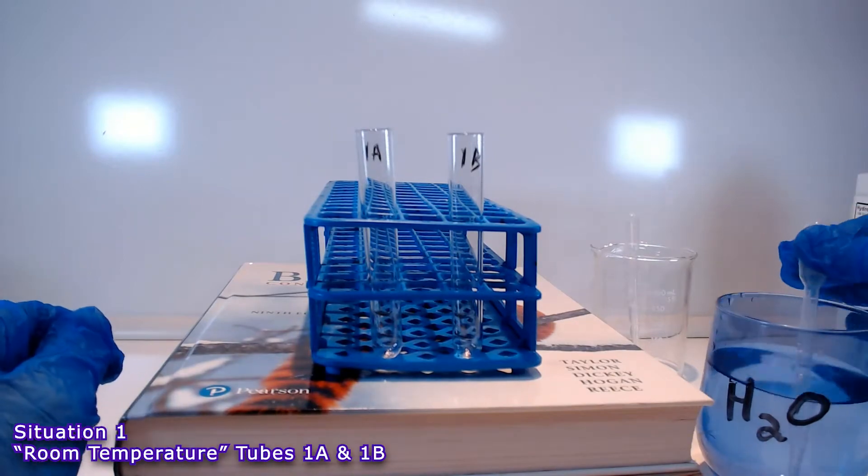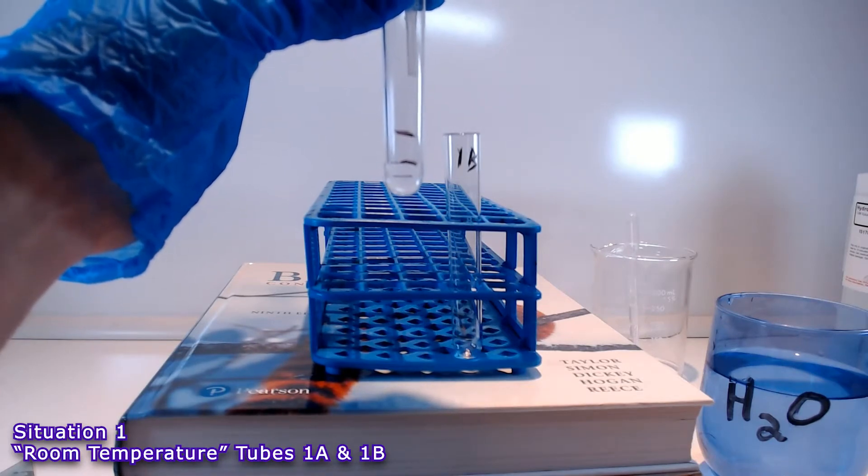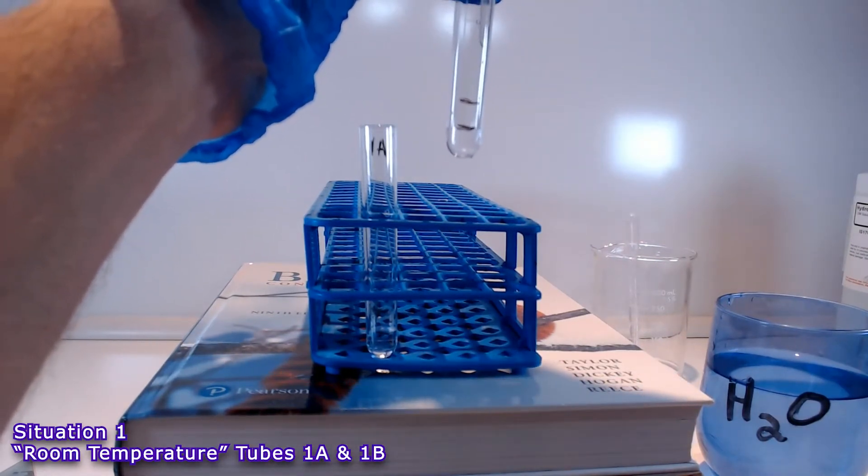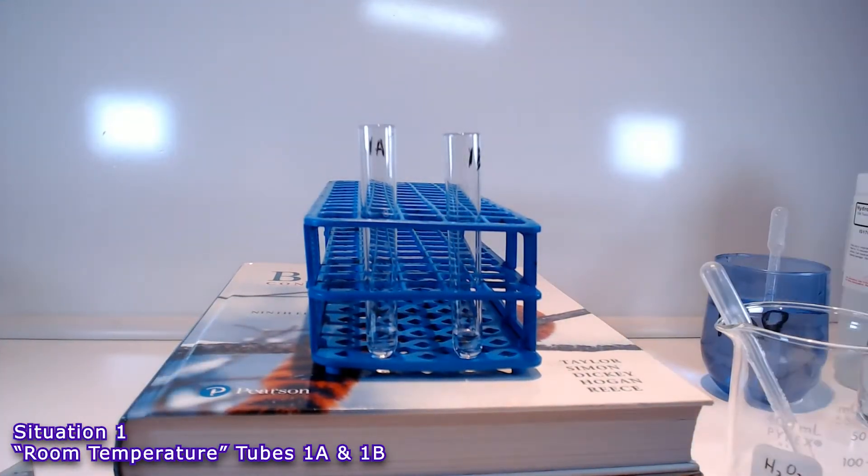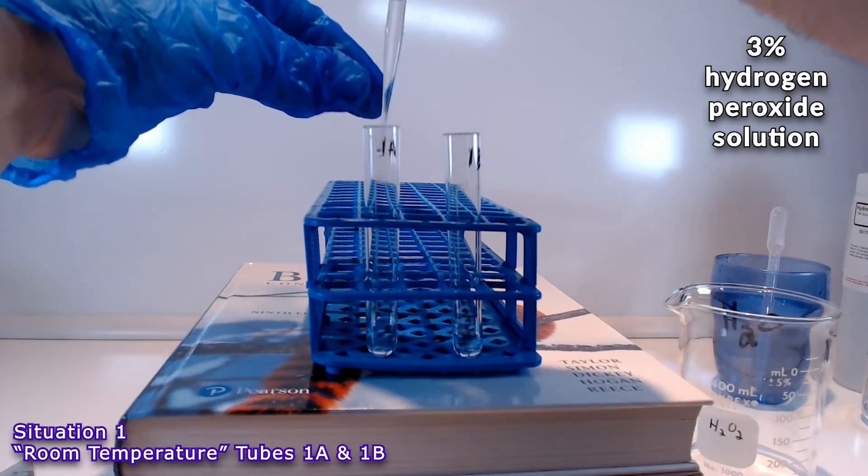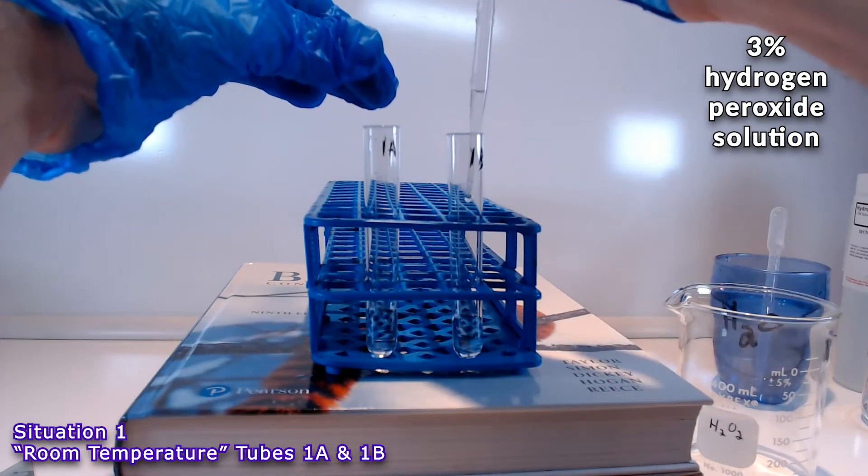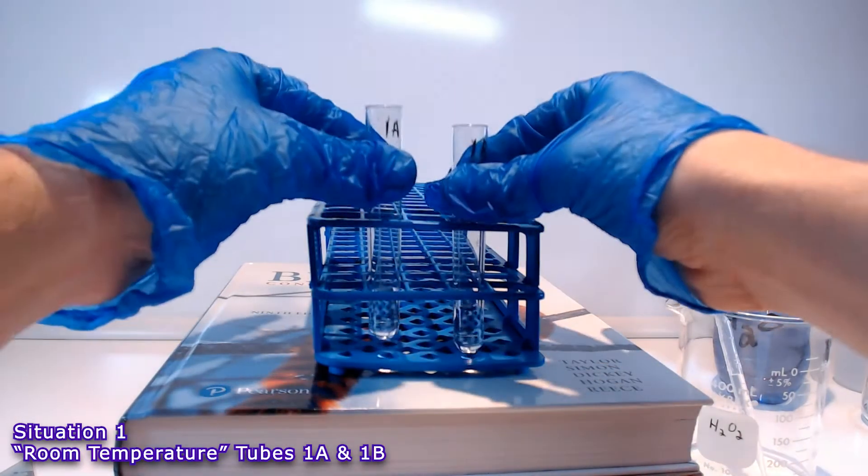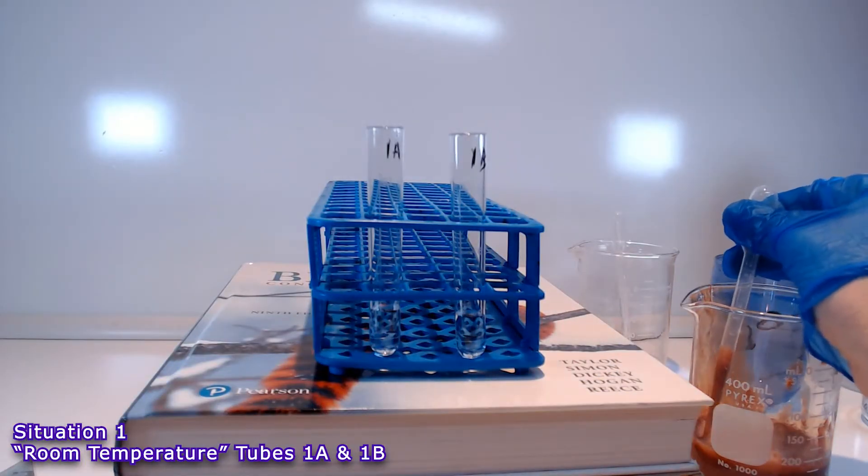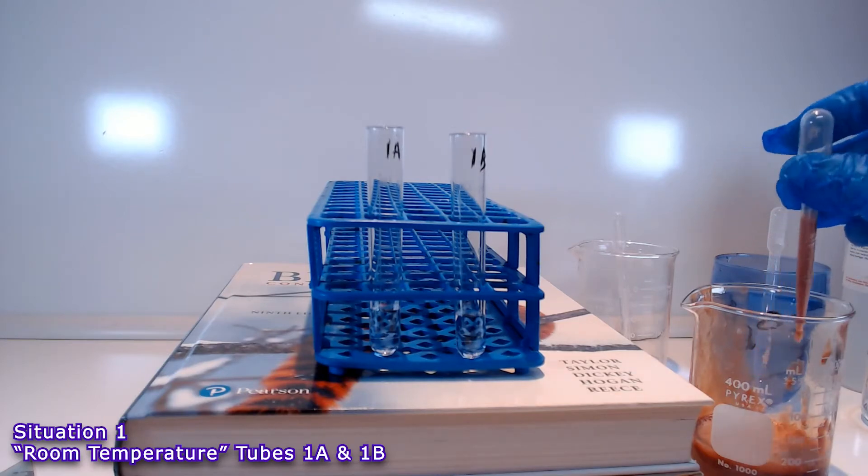Into tubes 1A and 1B, we fill them with water up to the one centimeter line. And then we fill the tubes with H2O2 hydrogen peroxide up to the two centimeter line. Now we're going to add five drops to each tube of our liver homogenate and watch the reaction.